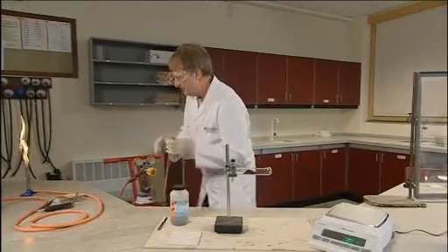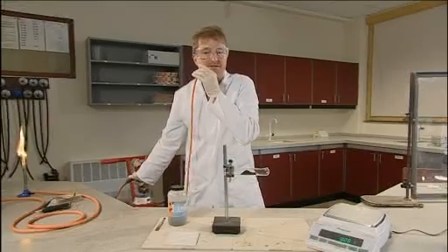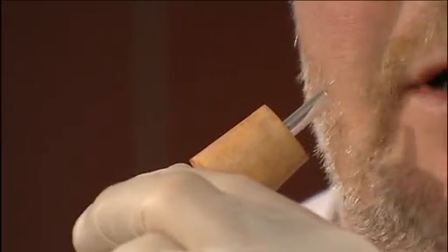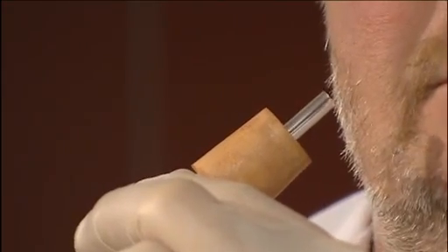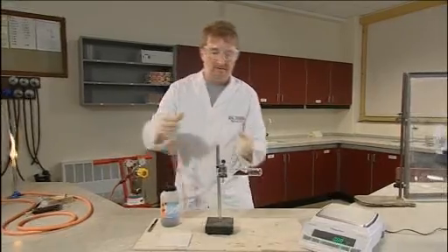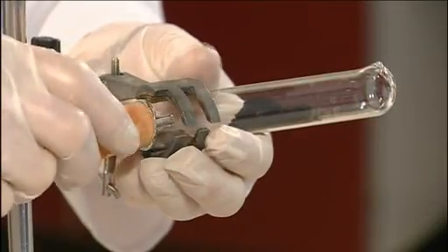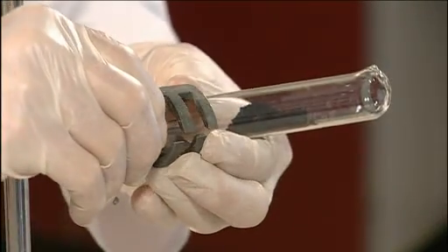We now use the needle valve to adjust the flow of hydrogen. A rate of flow that you can just feel on your cheek is about right. Now place the hydrogen delivery tube in the end of the reduction tube.